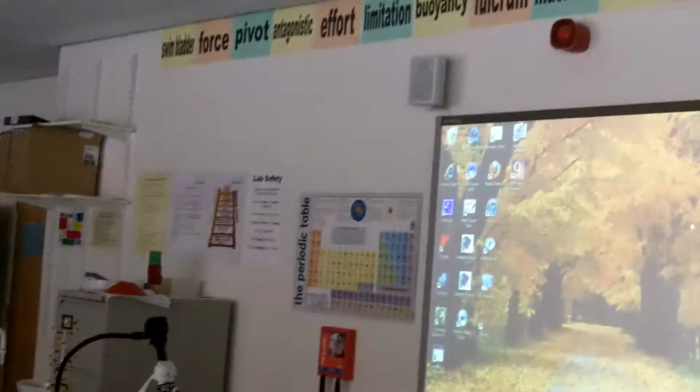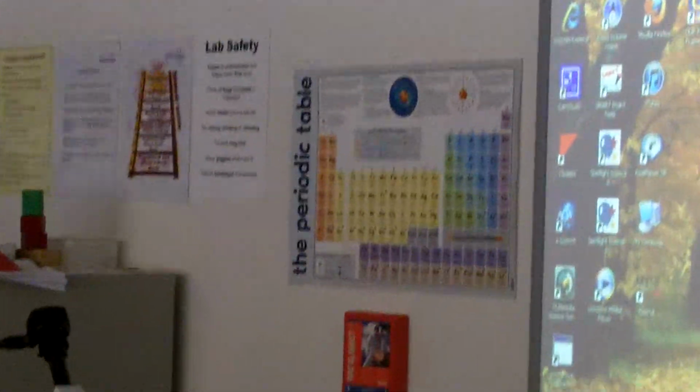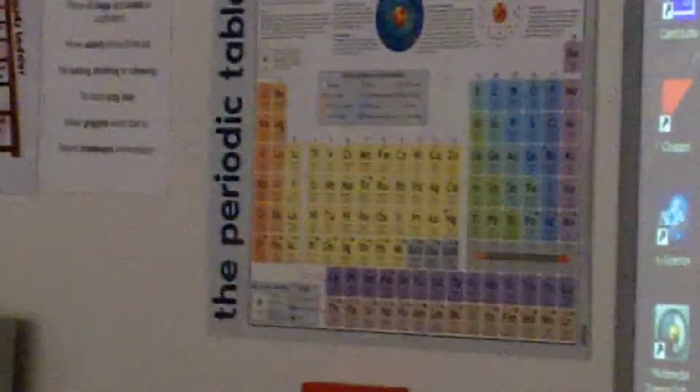Let's do sodium. Sodium is the next one down on the periodic table. And I'll show you what sodium looks like. There we go. That's sodium metal. And again, what I'll do is I'll cut it.